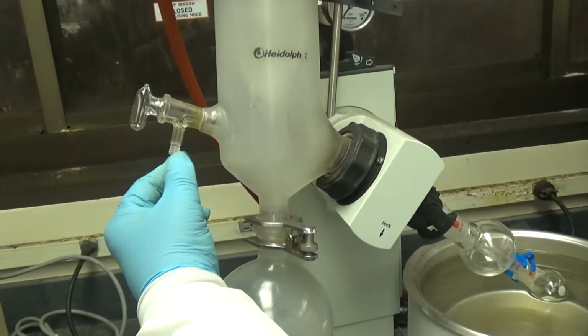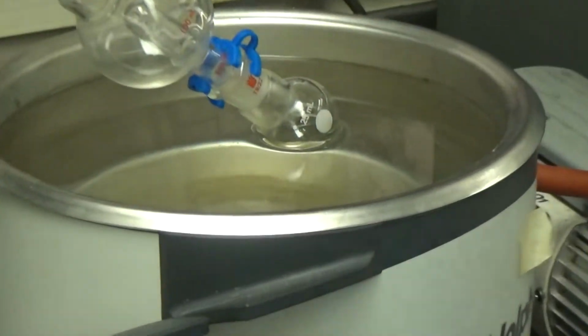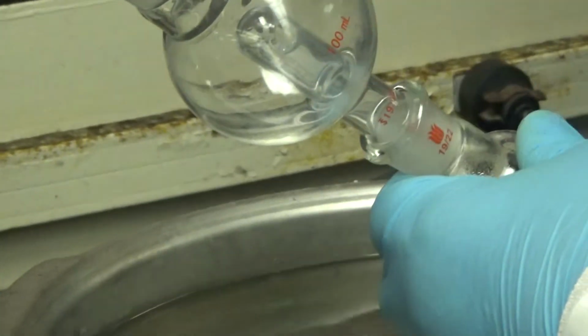Because if you don't release it, you're not going to be able to take the flask, because the vacuum would hold it on. Now take that.